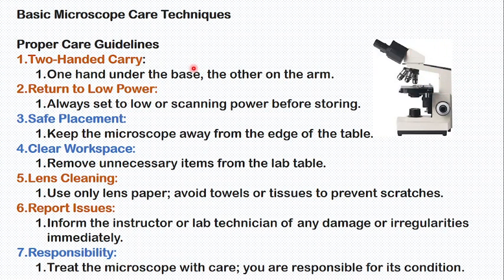I hope you are understanding. Care number one of the microscope is that you should carry it with two hands. Other things: after finishing using the microscope, remember to turn the objective lens.